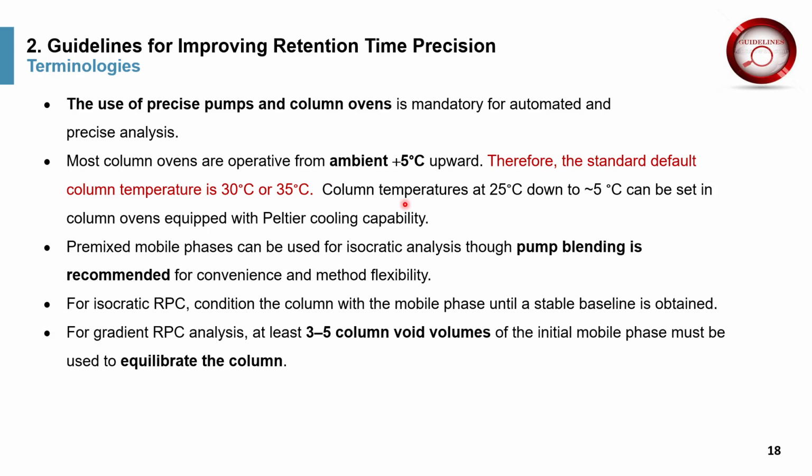So this is the standard for HPLC. Most HPLC methods thermostat at these standard temperatures. Generally, you can go up for pharmaceutical analysis. We rarely go above 60 degrees. Some protein peptide operations can go to 80 degrees, but beware of on-column degradation if you go too high.